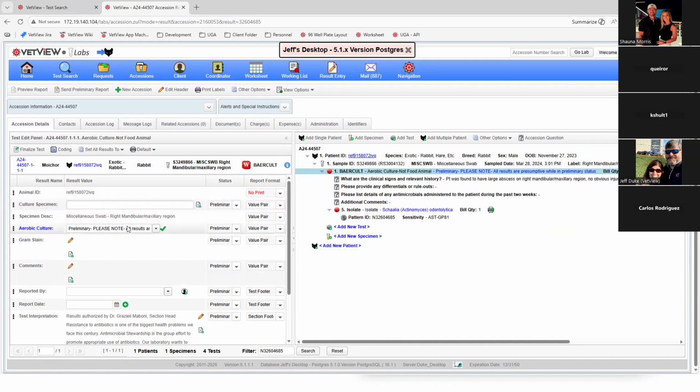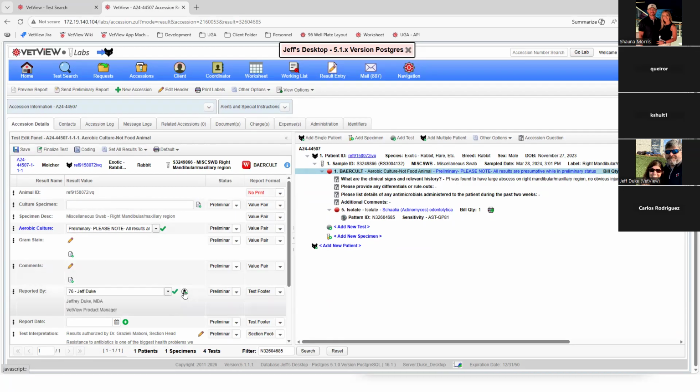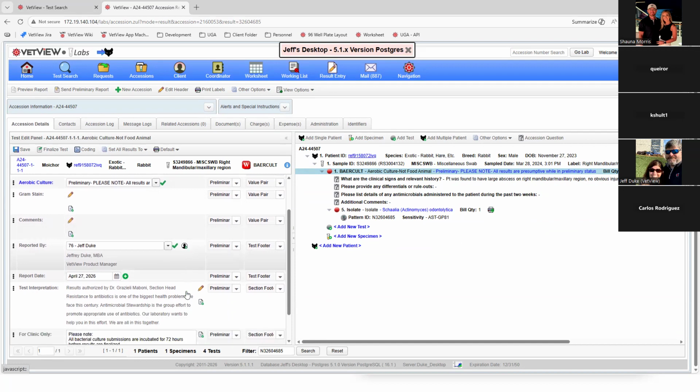One thing I want to show though is that the arrow keys work. So if I arrow down, you'll notice my cursor is hopping to all of the edit fields there. Sometimes, like with signature boxes, it's common that I'm going to put my own name in there. And so we give you a quick icon, a select me button, to pop mine in there. Or then maybe the add the date button, add now. So lots of places we have little icons here. Again, if you roll over your cursor, you'll find what that allows you to do.